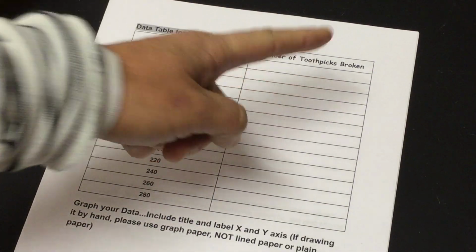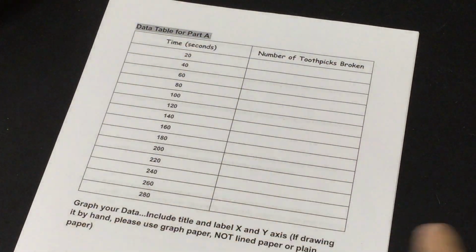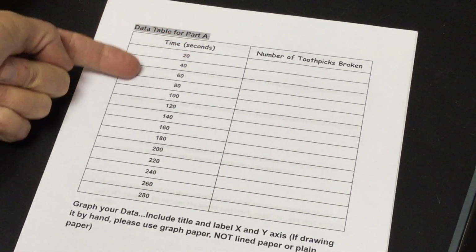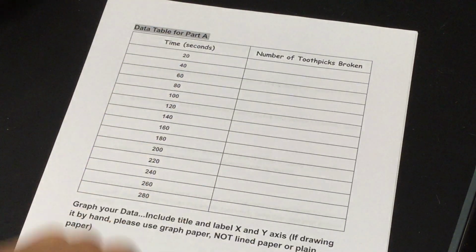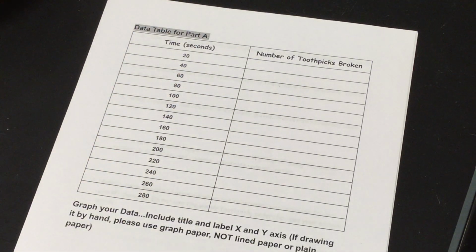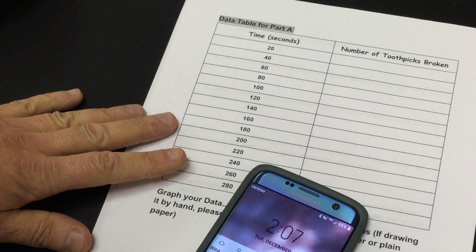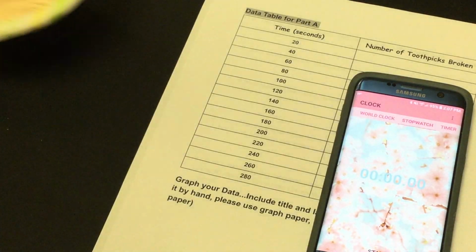I'm not going to tell you what the number is because I can't count and keep track and write things down. So you'll see my timer in here. It's going to be on my phone. And you'll see every time it gets to be 20, 40, 60, 80, we're going to go up to 4 minutes and 40 seconds. So these numbers should increase along the way. And then we'll talk about what's going on with those particular things as well and what we're going to see. Let me see if I can get a little timer set on my phone for you. You're looking for every 20 seconds.